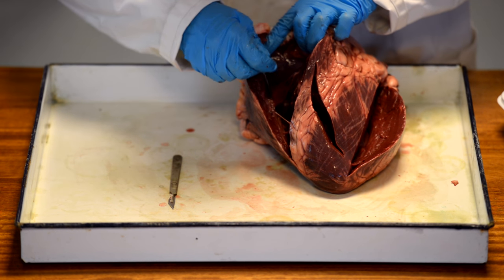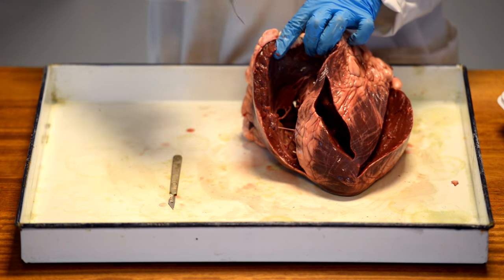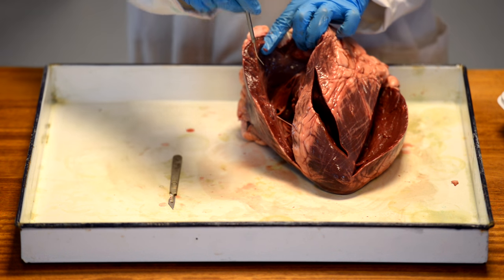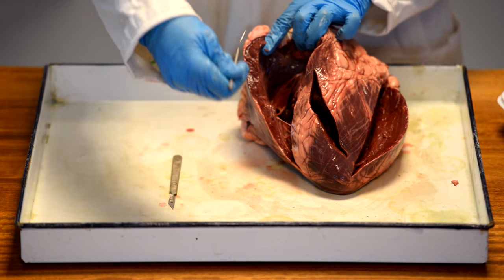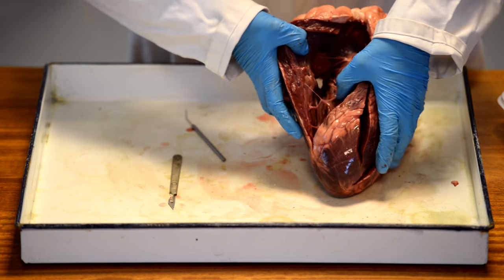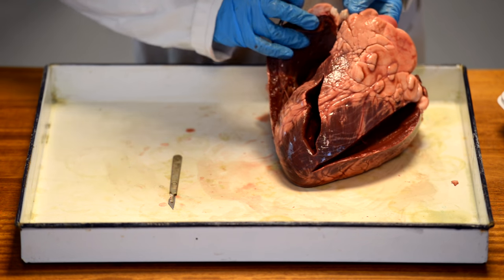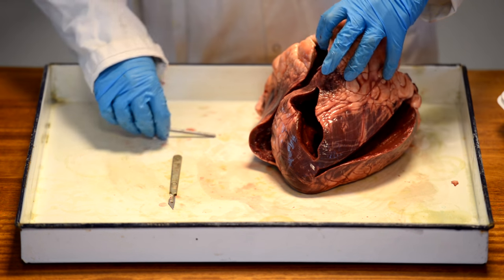You can see this tissue here, which is the valves. So this is the valve that is between the atria and the ventricle, the atrioventricular valve. It's a huge valve because when this heart beats, the purpose of this valve is to stop the blood from flowing back out of the heart the way it's come in. What we want to have happen instead is that when the heart beats, we want the blood to leave the heart, pass the valve, and out through the pulmonary artery and back to the lungs.